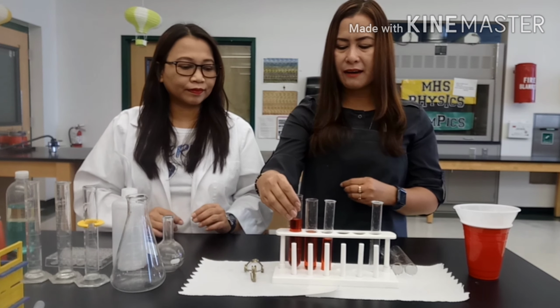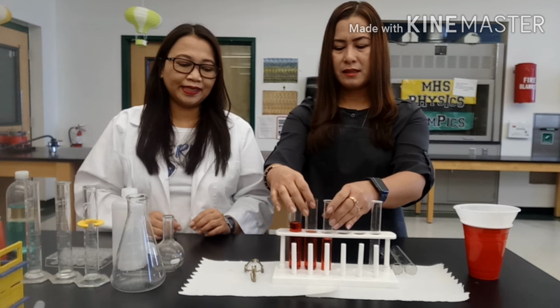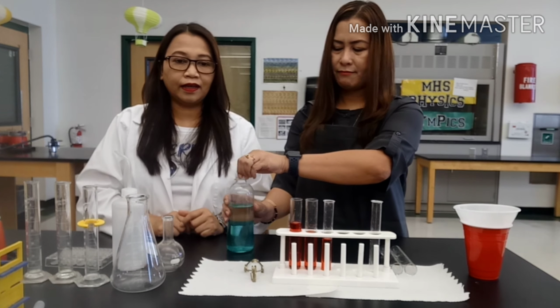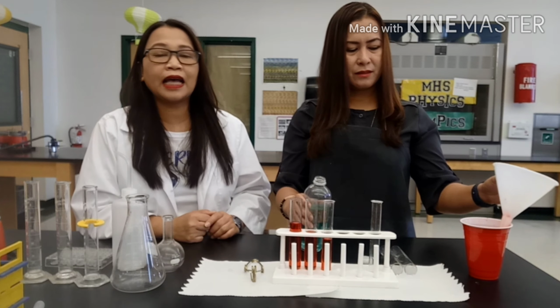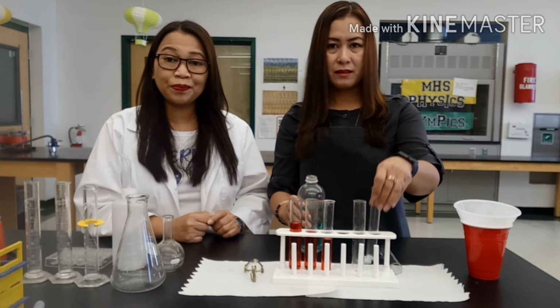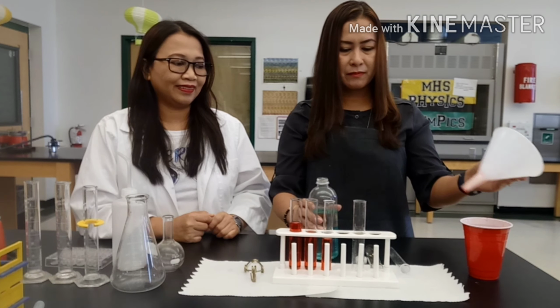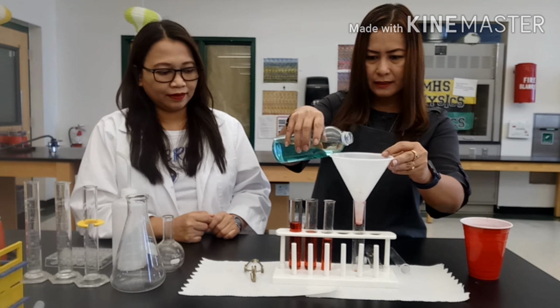Say for example, we have different measurements of liquids. If we're going to mix two different liquids inside the test tube, this is how you're going to do it. Put your test tube properly on the test tube rack, and then of course using your funnel, pour your liquid inside.